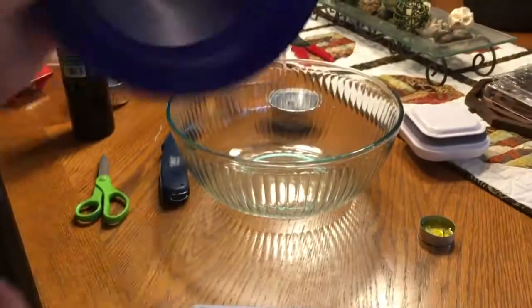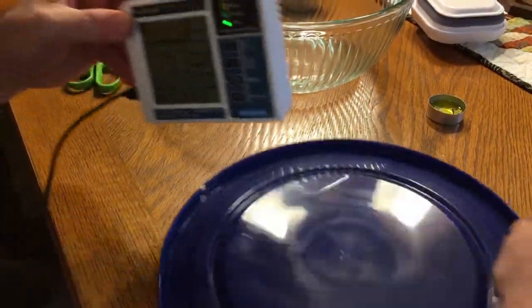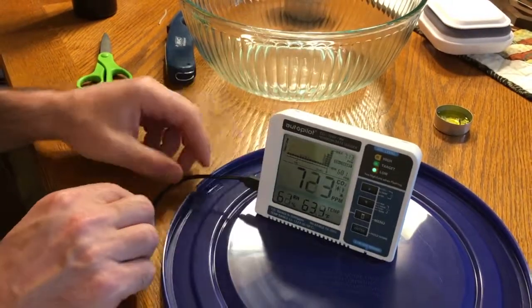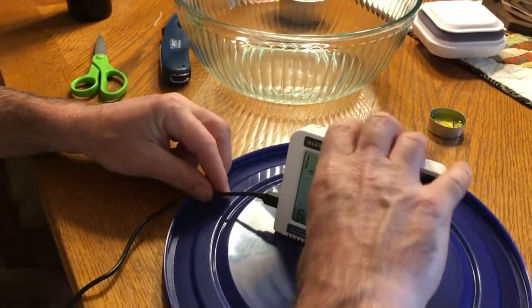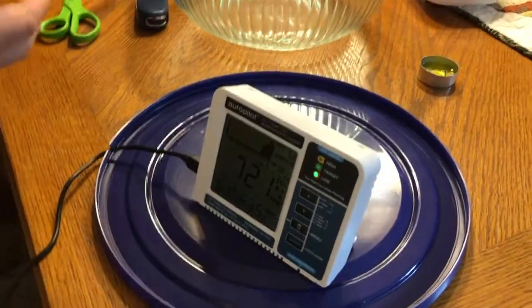This lid that goes to this Pyrex bowl — I've cut a little notch on the side for the wire to go through, so that it can be like this. We can leave it on the inside, and then we can close the top over it after we get the candle — food burning in it.